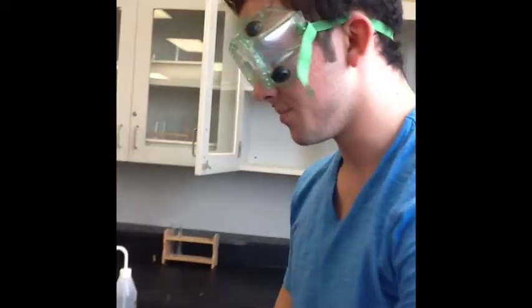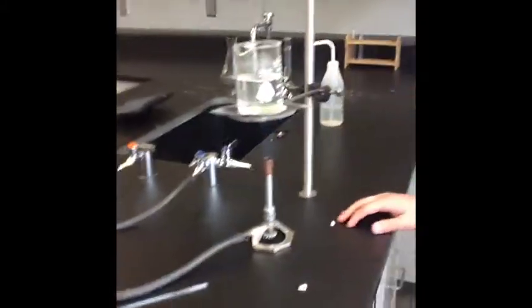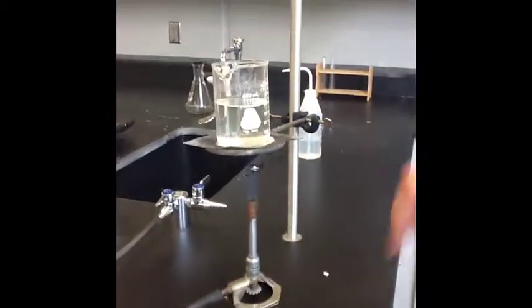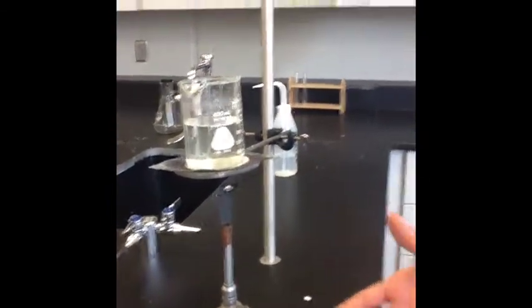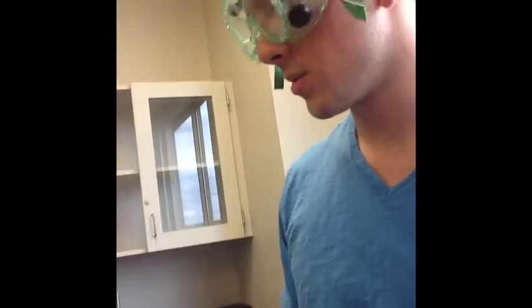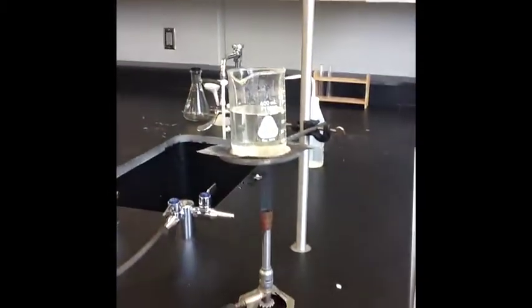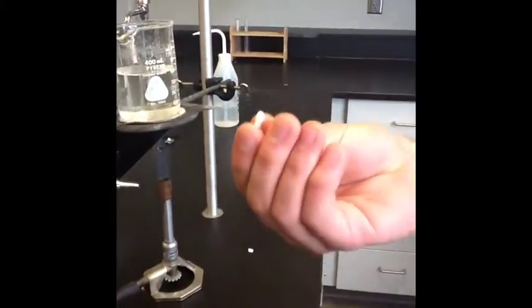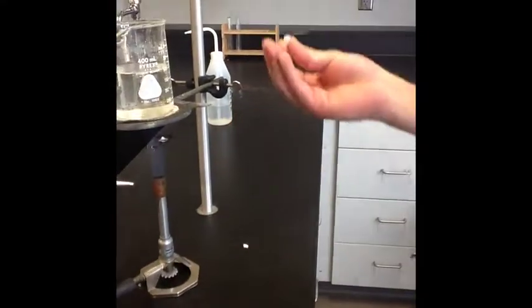Alright, so we let the solution sit overnight until the precipitate, the cloudy liquid within the solution, dissolves completely within the excess acid. And now we're just boiling off the excess water until it hits 50 milliliters on here. And when we hit that point, we will hopefully see some kind of formation, and then we'll be done for the day. And here is a chip that helps when it's boiling, so the bubbles aren't too large like they are now.